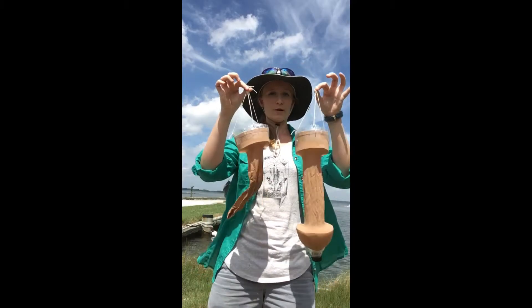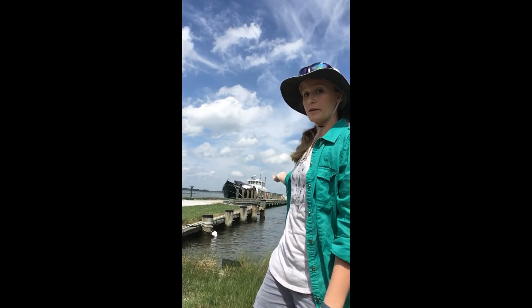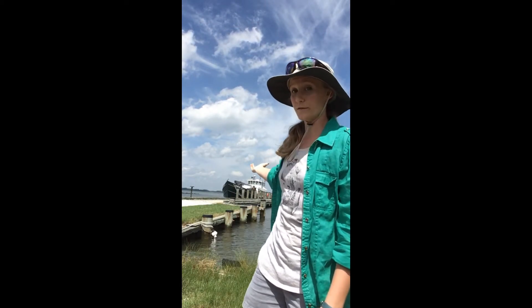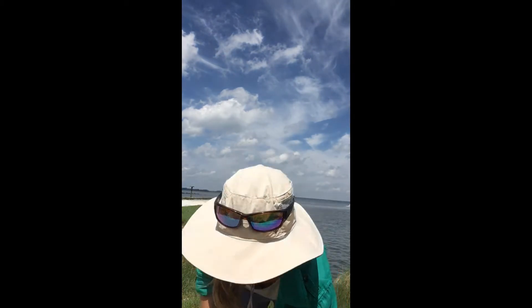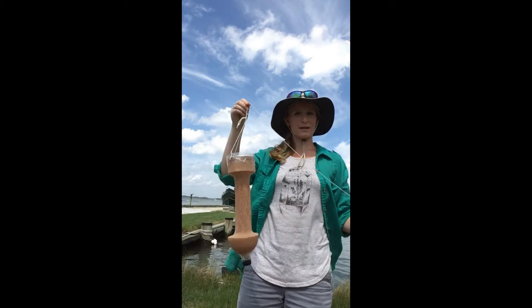Now that you're the proud owner of a plankton net, it's time to go sampling. You'll need to locate a body of water. I'm here at the Horn Point Pier so we're going to be sampling the Choptank River today. You will also need a long length of rope or string to tow your net, a cup, and a clear jar. Fill this cup with water from your water body and now it's time to tow.